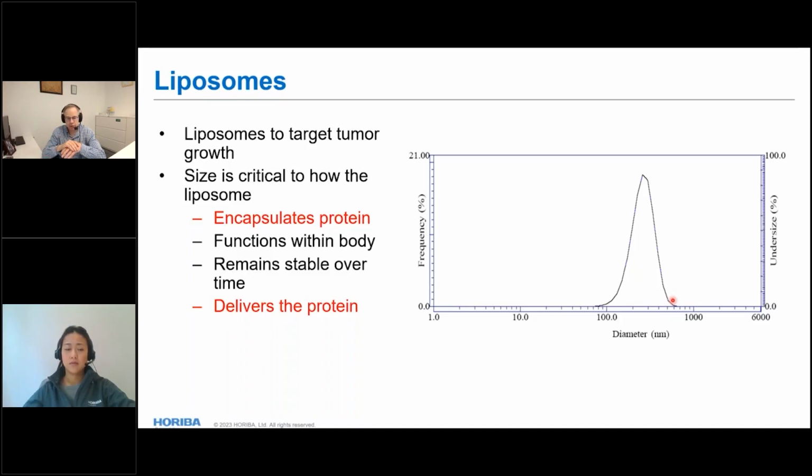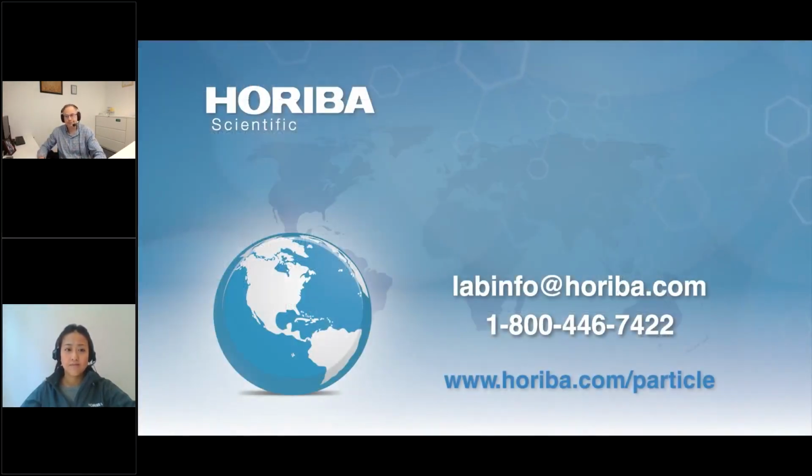And so you really want to do your analysis particle by particle, either with nanoparticle tracking or separation centrifugation, depending on size range. Yeah, probably out of scope of this webinar, but those are my comments there.